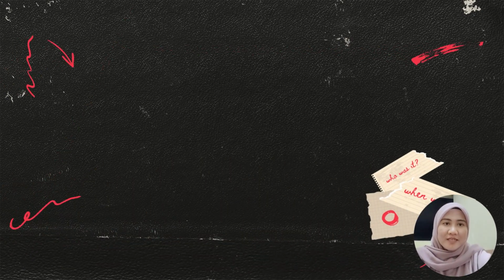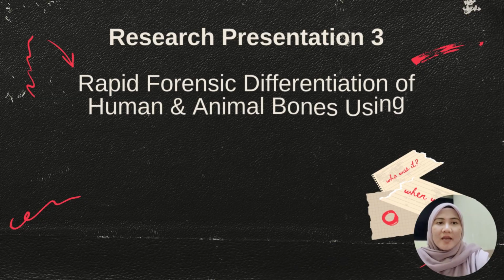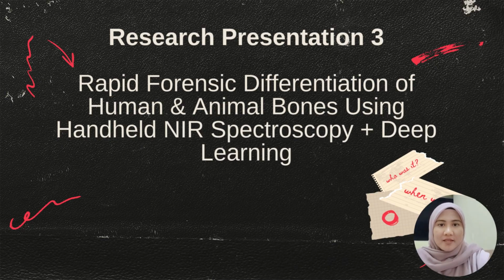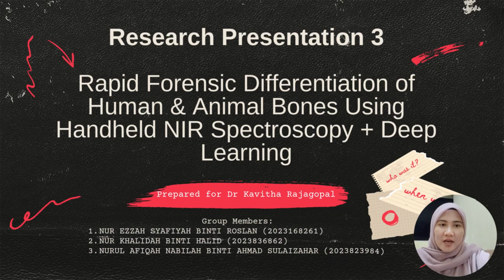So this is our research presentation, which the title is Rapid Forensic Differentiation of Human and Animal Bones using handheld NIR spectroscopy and deep learning. My name is Nurul Afika Nabila Ahmad Zahar. My group members are Izzah Shafiyah, Roslan and also Nur Khalidah Halid.